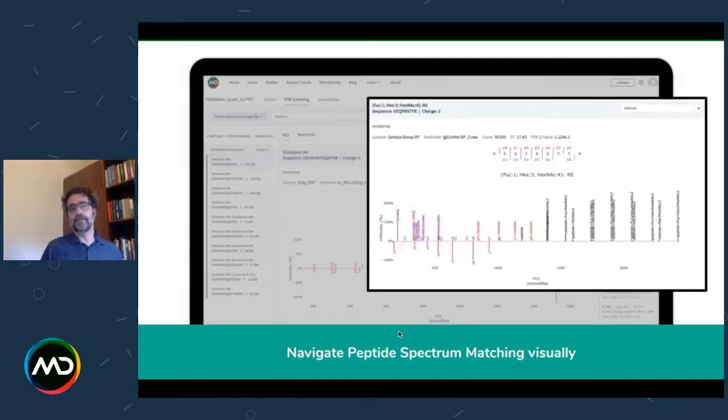So in here, I'm simply showing an identification of a glycosylated peptide just to make a little bit of a point, and that at least in ideal conditions, such as the one shown here, we can highlight the presence of oxonium ion or peptide backbone fragmentations, and fragmentations within the glycosylation.